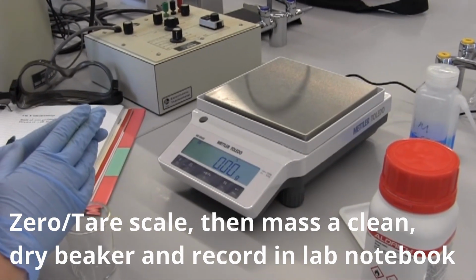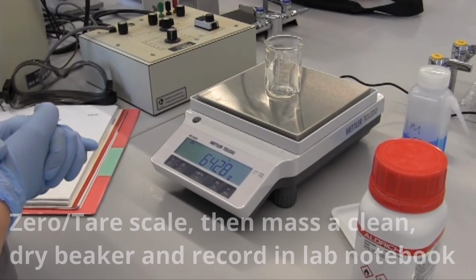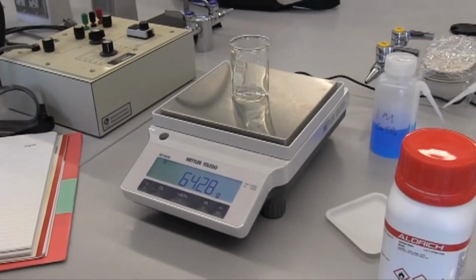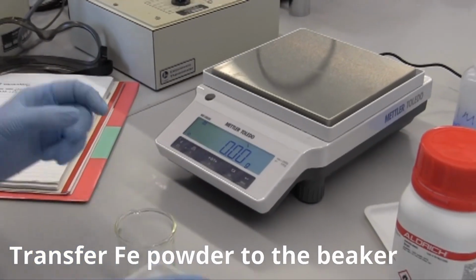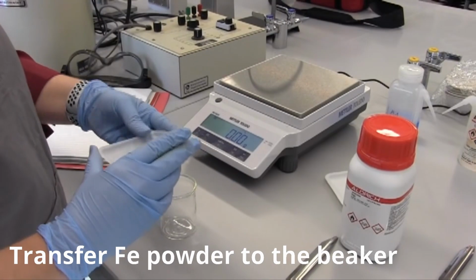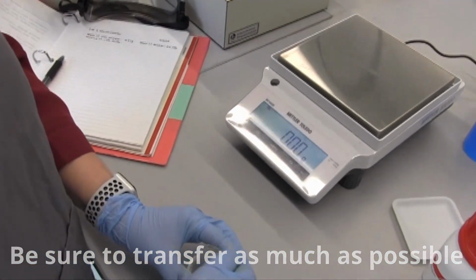Next, take the mass of a clean, dry beaker and record the mass in your lab notebook. Transfer the iron powder into the beaker, taking care to transfer as much of it as you possibly can.